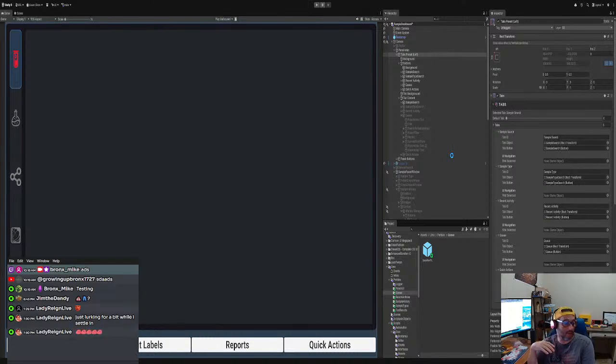So that's the last part we need to do for like the major listings. And then we could just work on the UI, just to make it look nice and neat. And then we could code review, make sure everything's nice and neat in there too. Everything makes sense, and there's no potential follow-ups.